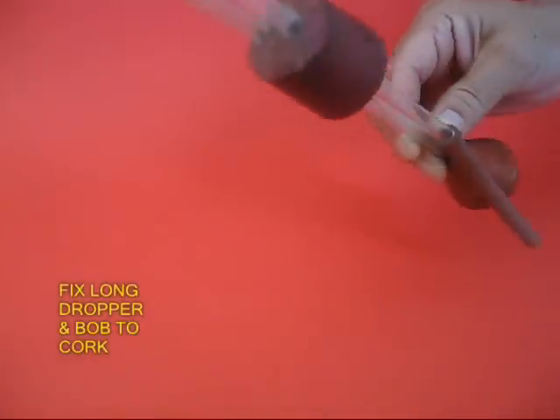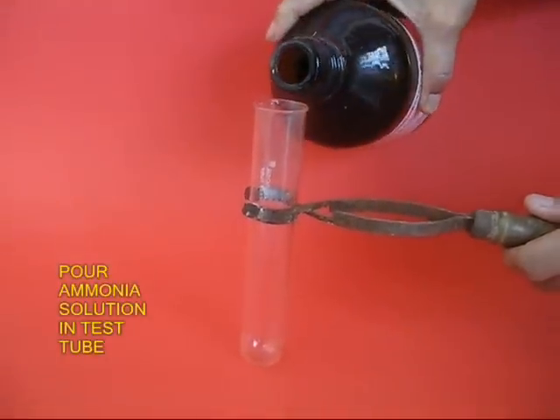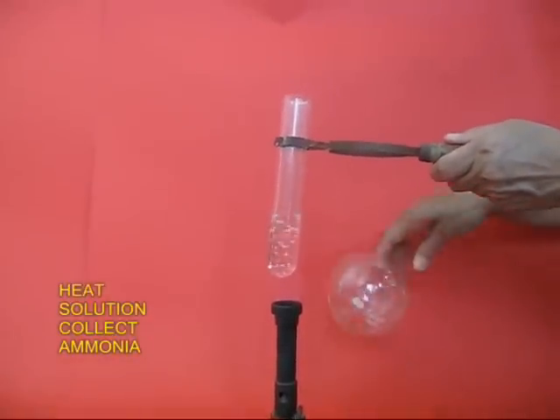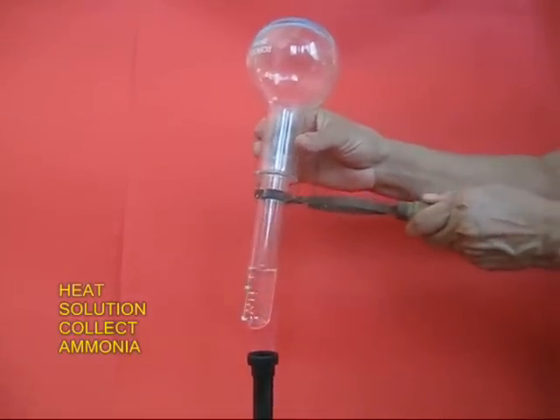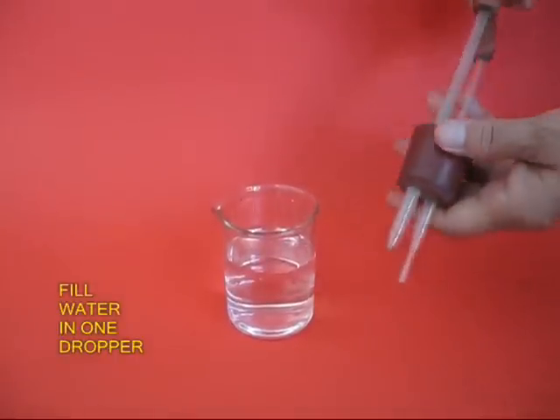First, fix two droppers with a bulb and a rubber tube. Pour some ammonia solution in a test tube and heat it. Ammonia gas would be expelled, and ammonia being lighter, you can collect it in the round bottom flask. Keep it inverted.